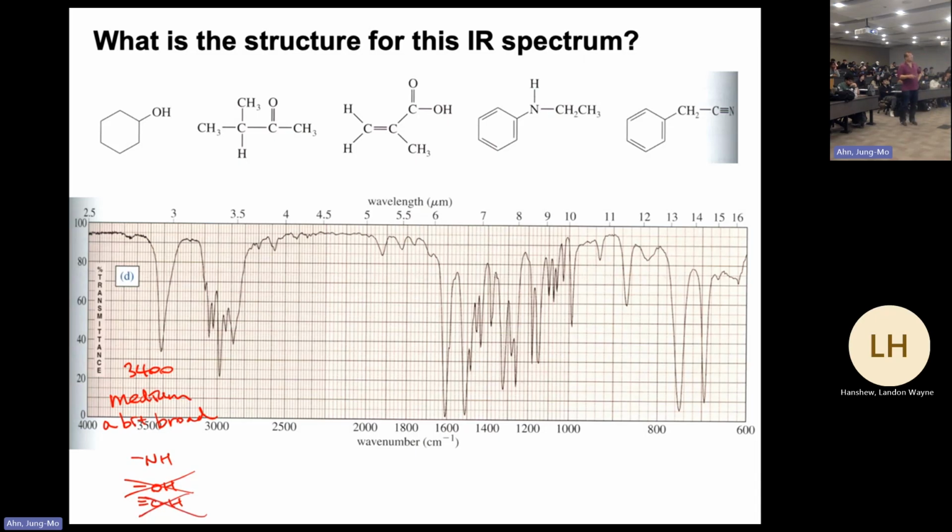There's a benzene, a 1600 signal right there. At the same time, this double bonded carbon hydrogen stretching is right here. So this molecule is probably going to be the amine with the unsaturated carbons available. On the other hand, the former example there is a hydroxyl group with everything saturated. So don't just look at one piece of evidence to sort them out. Try to look at secondary evidence to corroborate your idea to be confirmed. So that is basically my suggestion for doing the IR related questions.